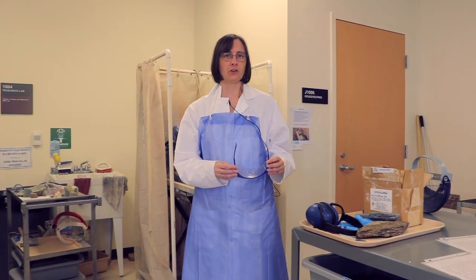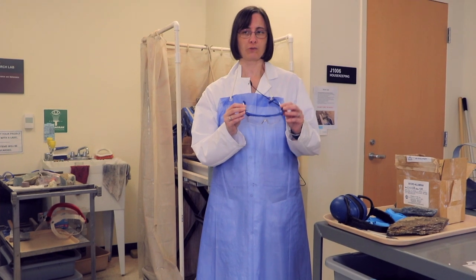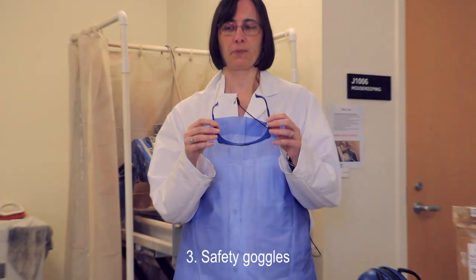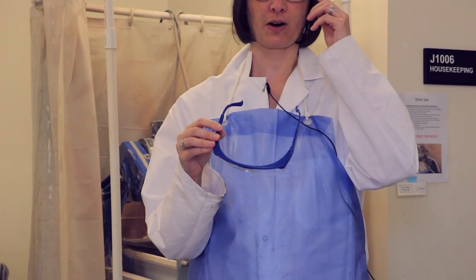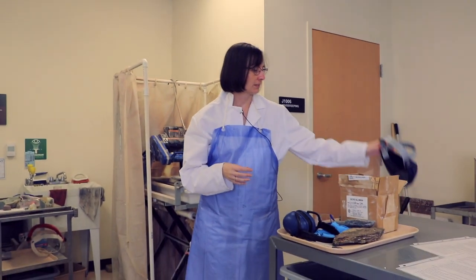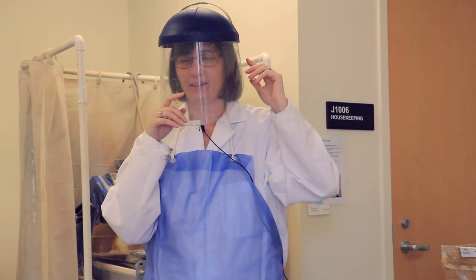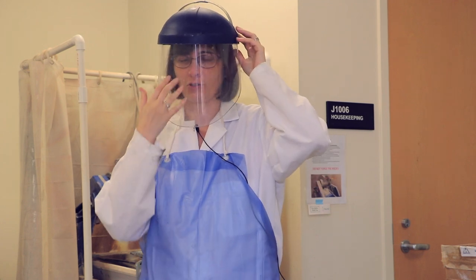Other things that you should think about when you're in the rock saw and rock preparation lab are safety goggles of some sort. For some things it may be okay if you're just wearing your glasses. There are other things like some of these larger saws where it's highly recommended that you wear either safety goggles like this, or in some cases if you feel more comfortable, you can wear a shield like this, although this does block a little bit of your ability to hear and see because often these are a little bit dirty on the front.